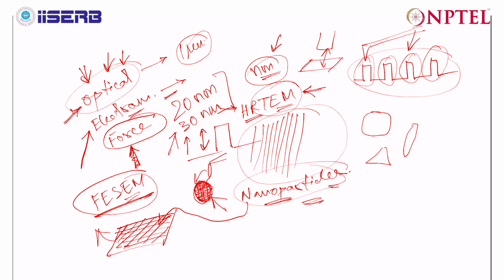If you think that under optical microscope the device structure is more or less okay, then to get more details, even details in micron range, you can also characterize the same using FESEM. Once you characterize the same using FESEM, you'll get an idea about the active material thin film or electrode in a micrometer range. So that is how one can characterize the device after the fabrication is done.